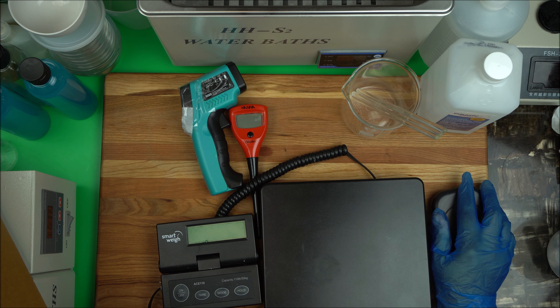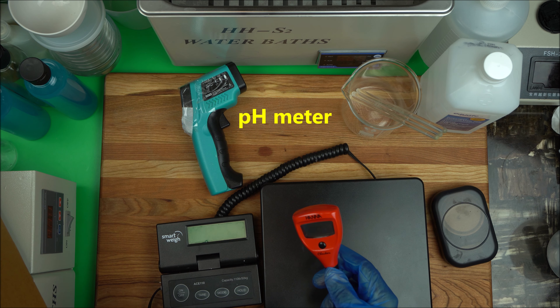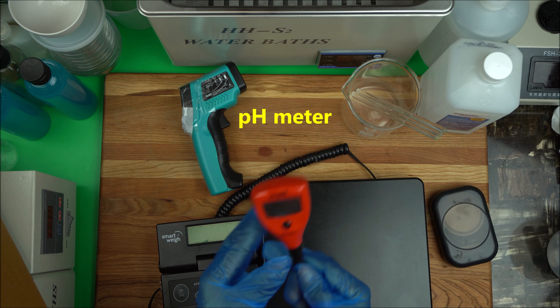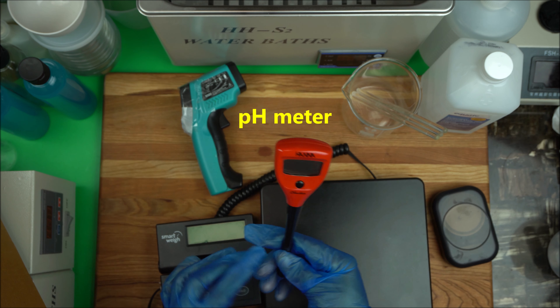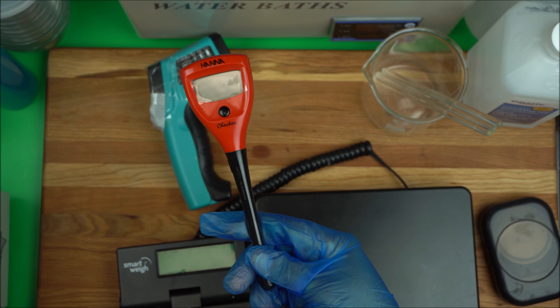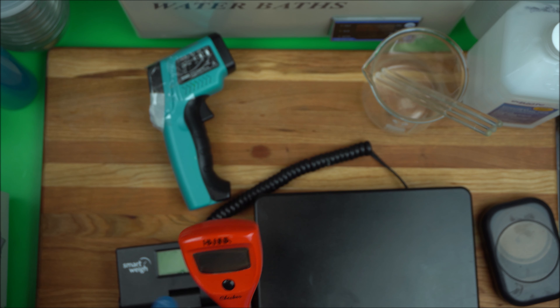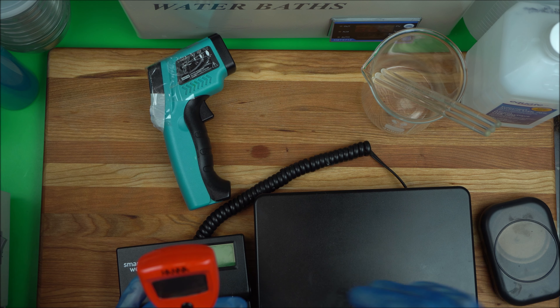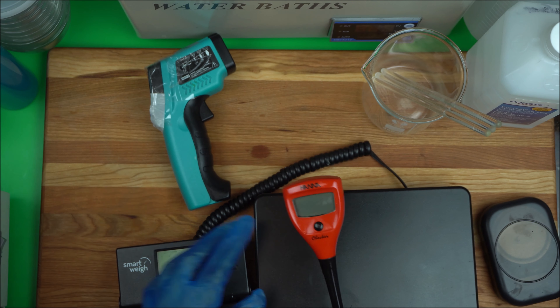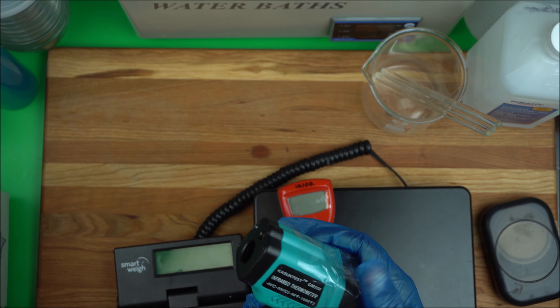A very important tool you need is a pH meter. If you are truly a serious cosmetic formulator, you must move beyond using pH strip paper to a pH meter, because a pH meter is a more reliable way of checking the pH of your product. At this point you should not be using pH test paper anymore — a pH meter is the most reliable way to check your product's pH.